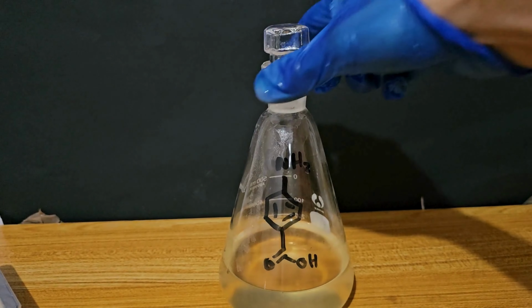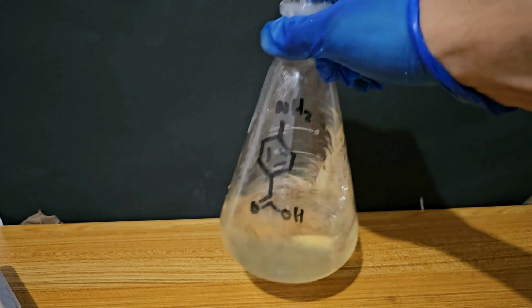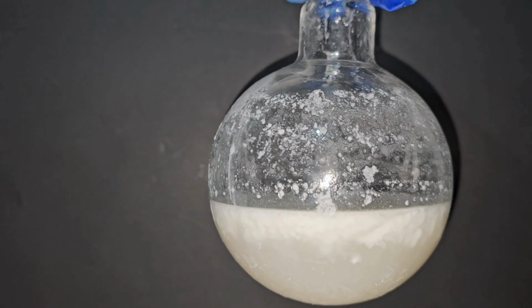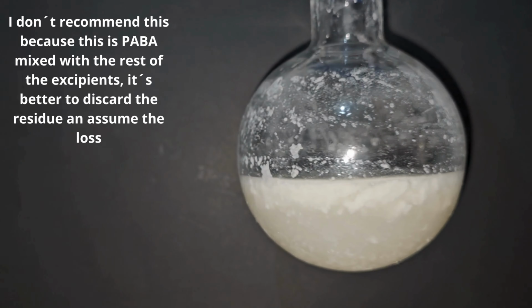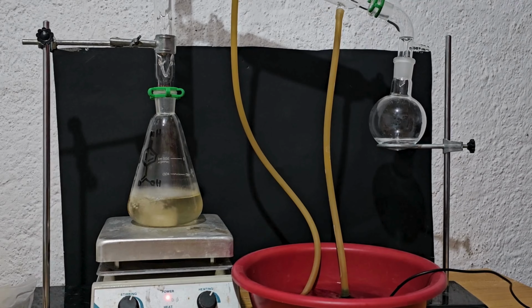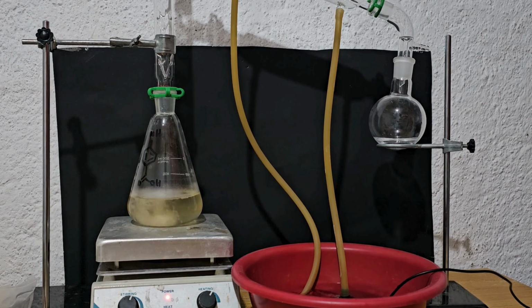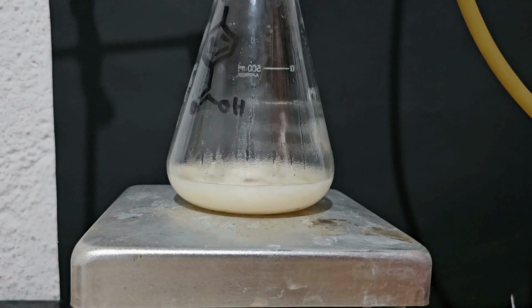I tried to filter the solution, but the gelatin made it impossible, so I just decanted it off and left behind the solid residue. I added water to the residue in order to wash out all the para-aminobenzoic acid left. Then, I removed the methanol by fractional distillation. After a while, all the methanol had been removed.